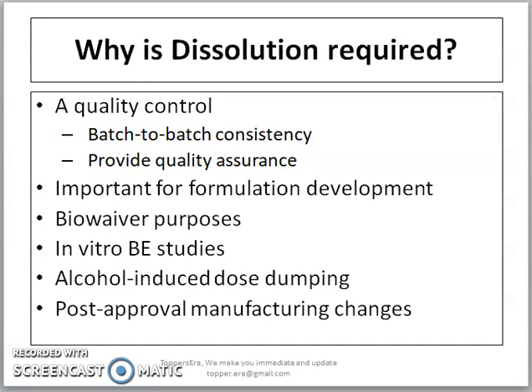Now, if we think about its application, the dissolution test is applicable in quality control for batch-to-batch consistency and assuring quality of pharmaceuticals. It is an important CQA during formulation development and for biowaiver purposes.